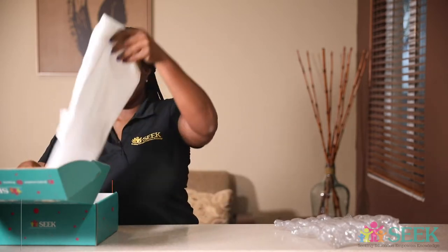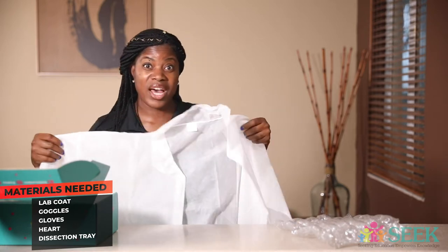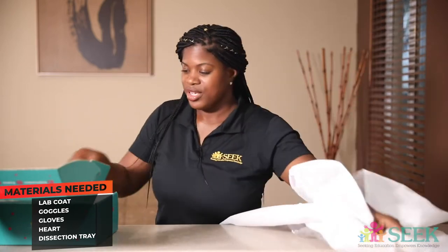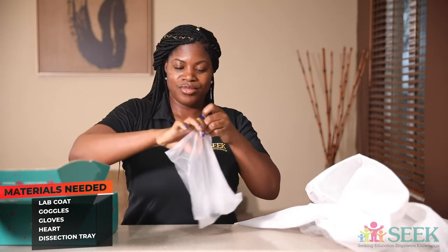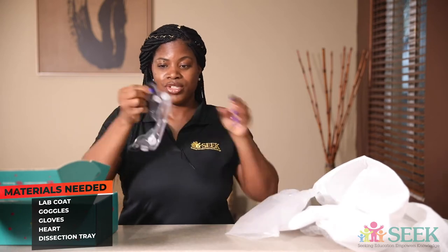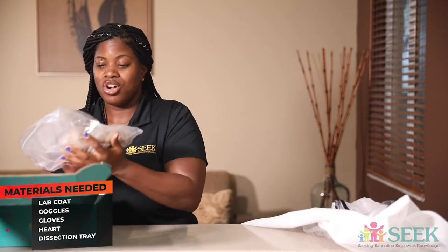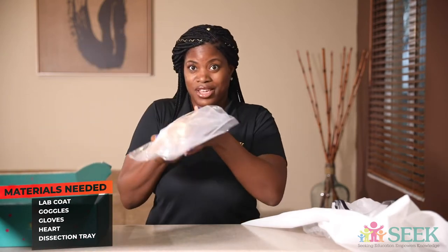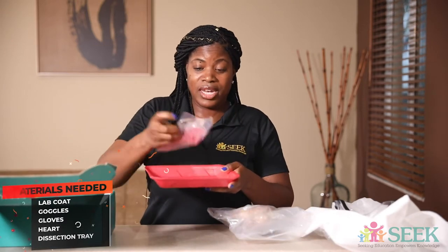Some of the materials you are going to need: it comes with a lab coat, because we don't want to get all the messy juices on our clothes. You also have a pair of goggles for safety precaution. And you have the actual heart, a dissection tray, cutting utensils, and things that you need so that we can separate the different parts of the heart. So let's get started.